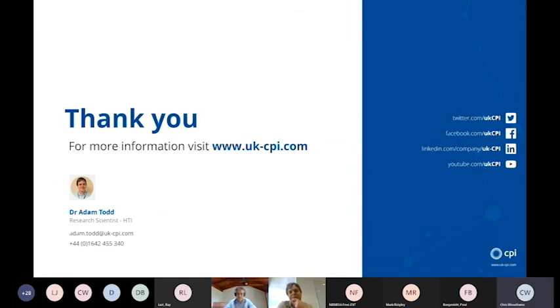Right. And have you developed any of the code you talked about in that presentation? Yes, I was the one who figured out how to include the emergency stop for the TFF. Oh, nice. Being able to put a hard limit on the pressure is probably the most important part of that particular interface. And I'm the one who's actually working on the MicroSTAR code now. Nice. And what sort of architecture are you using there? Have you gone for a particular framework, or have you done your own?